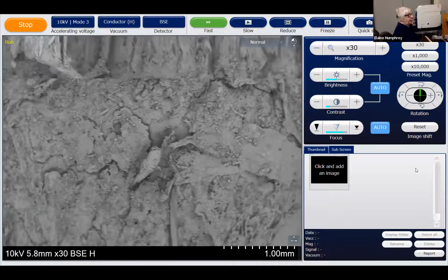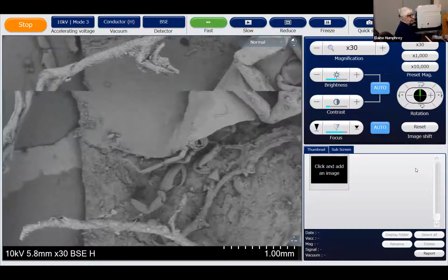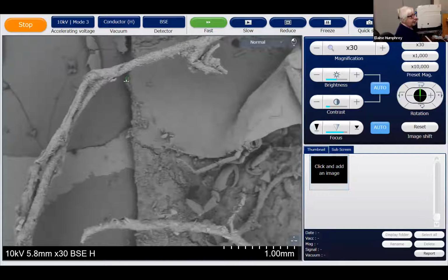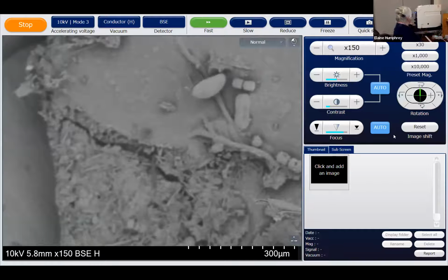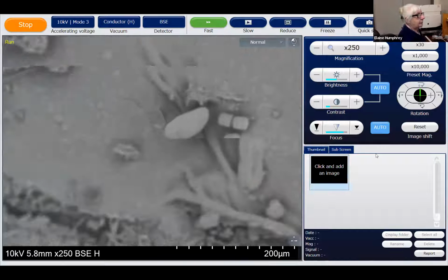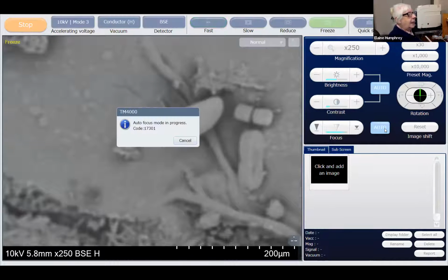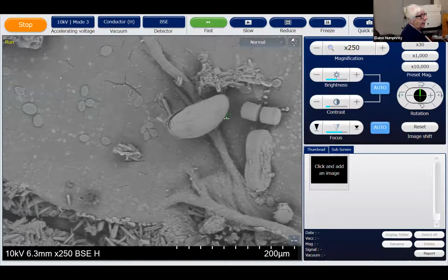But if we now move up here, here we have an ostracod. So the eelgrass has folded over, and we can see this guy here. So with a light microscope, you can see through this guy. Let's do an autofocus. And you can see his little legs, and you can see his heart beating in this one. So that's 200 micrometers. So he's about 150 micrometers. And there's some marshmallows. And there's one of the peanuts.